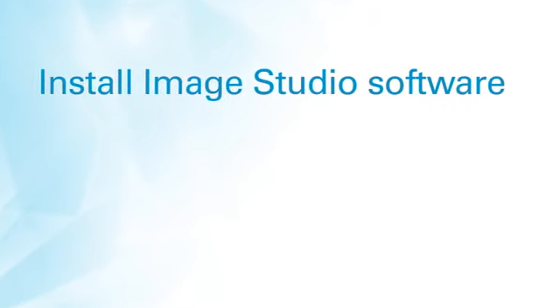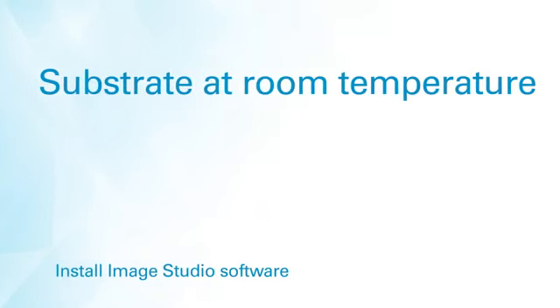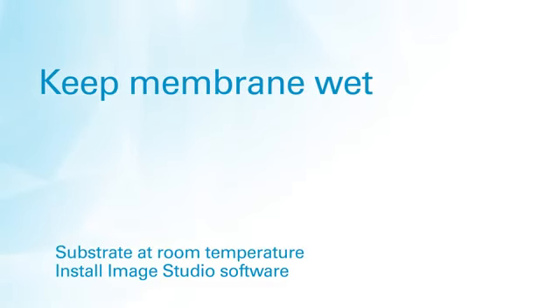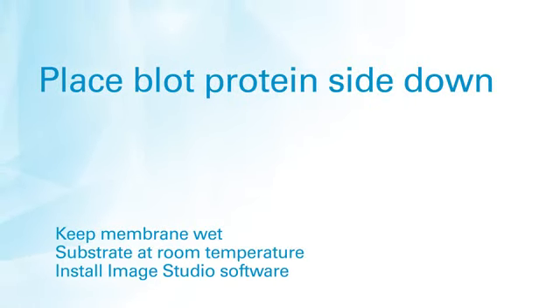So here's a quick recap of useful tips. Install Image Studio on your computer before connecting the C-Digit. Incubate using room temperature substrate. Wrap your blot so that it stays wet during the scan. Remember, the blot goes protein side down on the scanner.